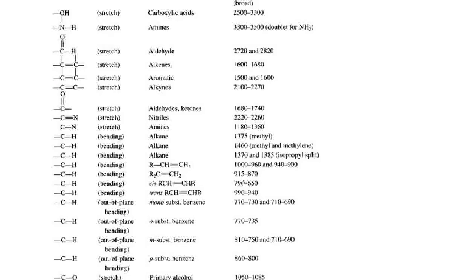An alkylidene structure has one peak, 870 to 915. That corresponds to what we have. So if this were an unknown, you didn't know what the structure was, you determined that it's an alkene, the existence of a peak around 900, a little bit below in our spectrum example, tells us that we have an alkylidene structure because we don't have a double bond at the end.